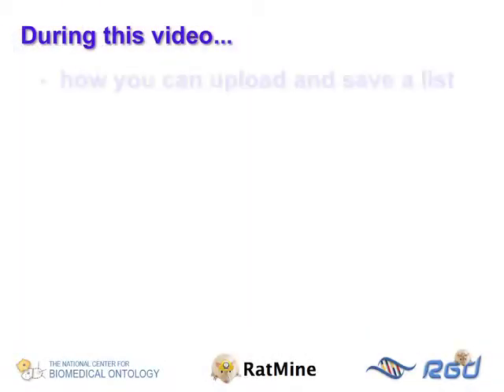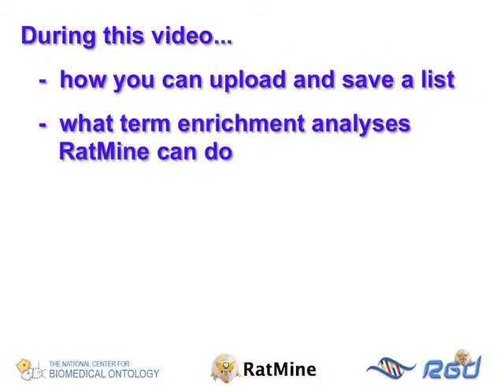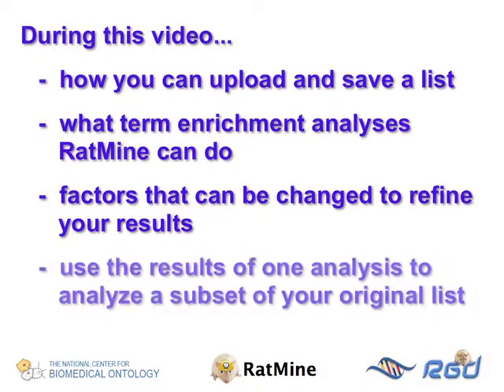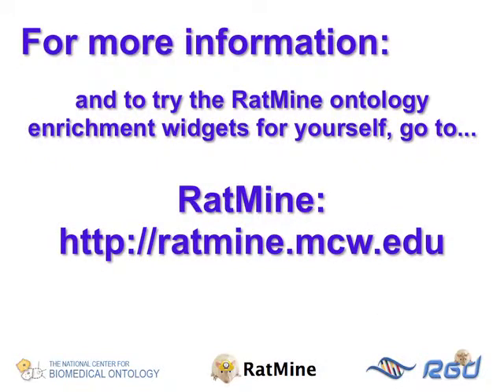During this video, we've looked at how you can upload and save a list, we've reviewed what term enrichment analyses RatMine can do on the genes or proteins in that list, we looked briefly at some of the factors that can be changed to refine your results, and we've seen how you can use the results of one such analysis to further analyze a particular subset of your original list. For more information and to try out the RatMine ontology enrichment widgets for yourself, go to ratmine.mcw.edu.